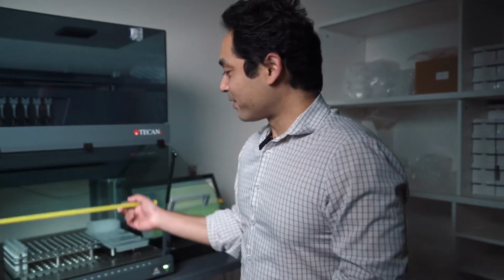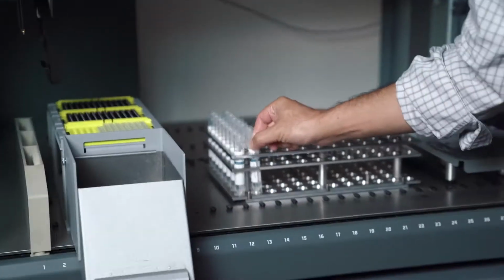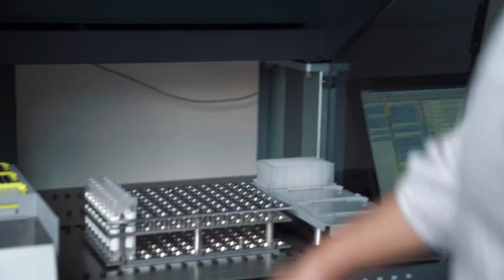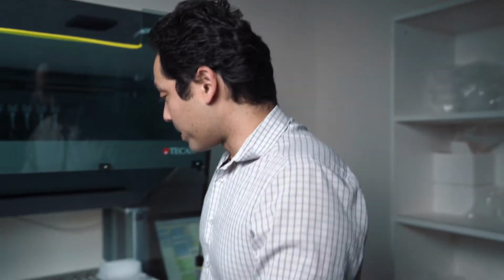So over here, what you can see is you have these collection tubes. These are just water in here. So this is, don't bust me for not having gloves. These are just sample tubes, and this is for demonstration purposes only. Obviously, use proper PPE when you're in the lab.